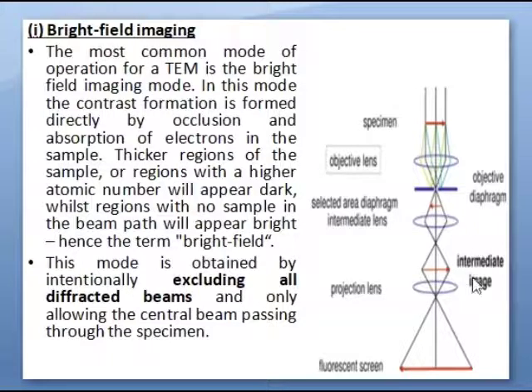In a similar manner, whenever the lighter elements of the specimen are there, it will allow the movement of electrons through the specimen and onto the screen. That means more electrons are passed onto the screen, so a brighter image is generated.